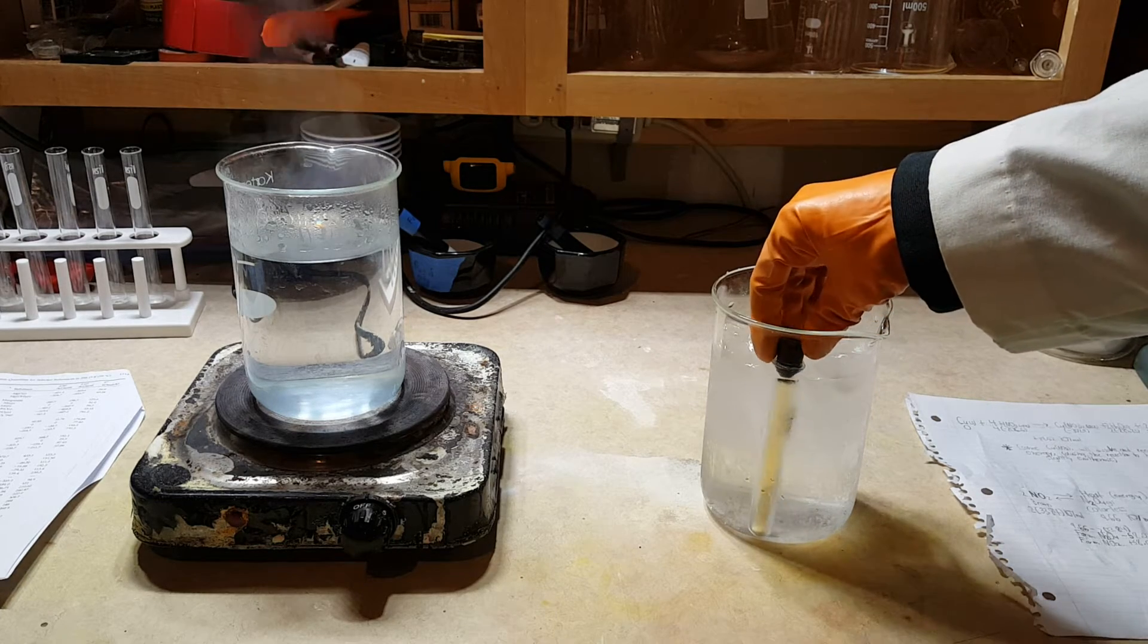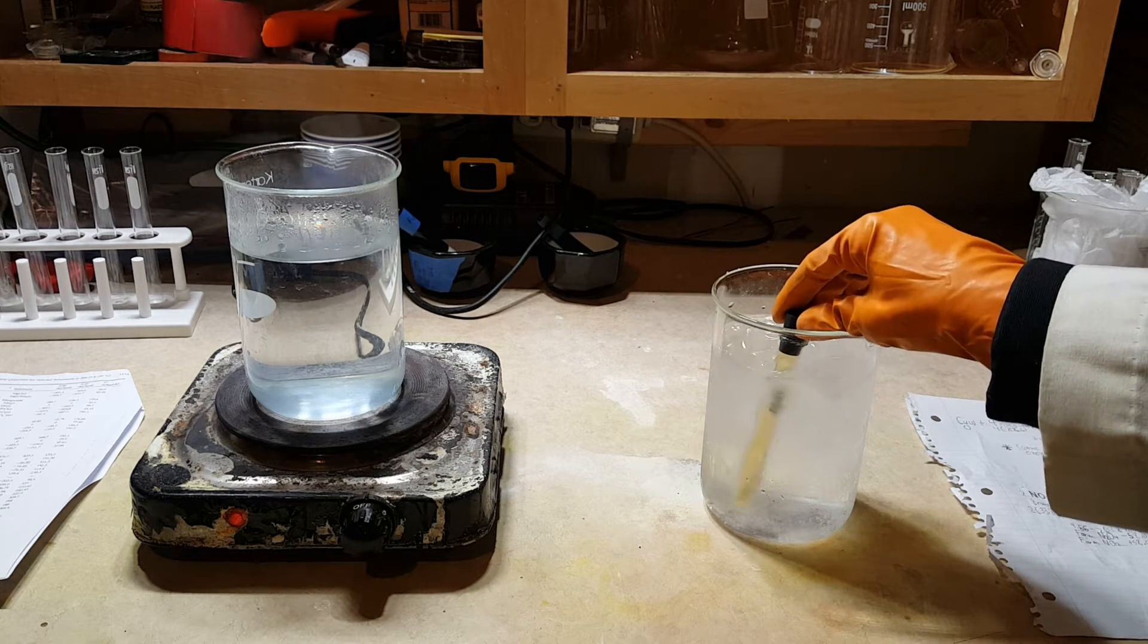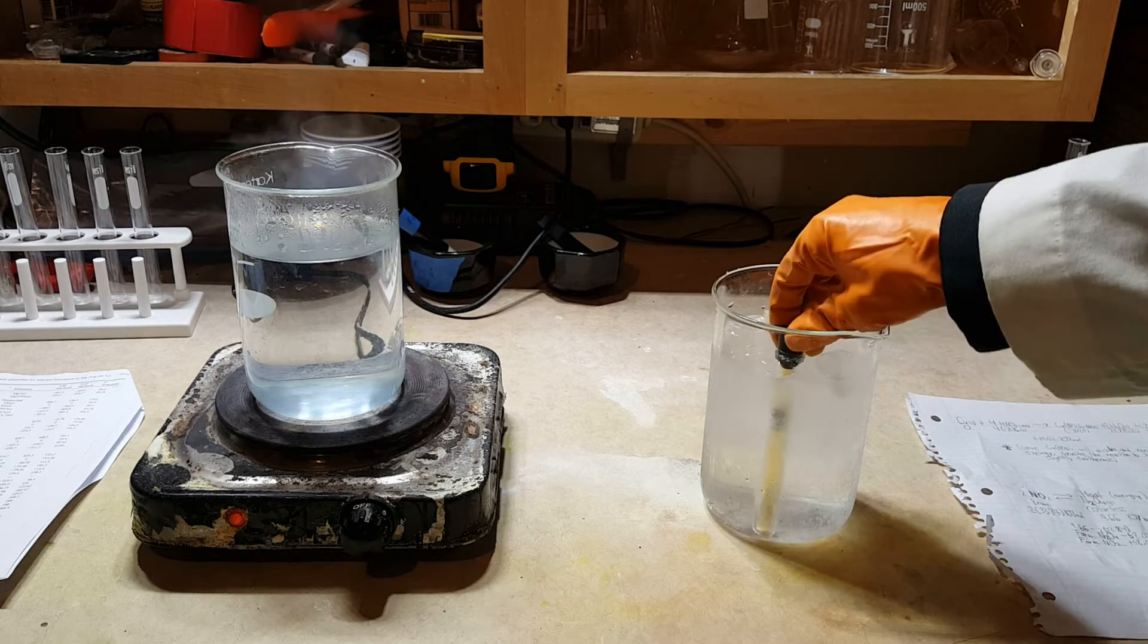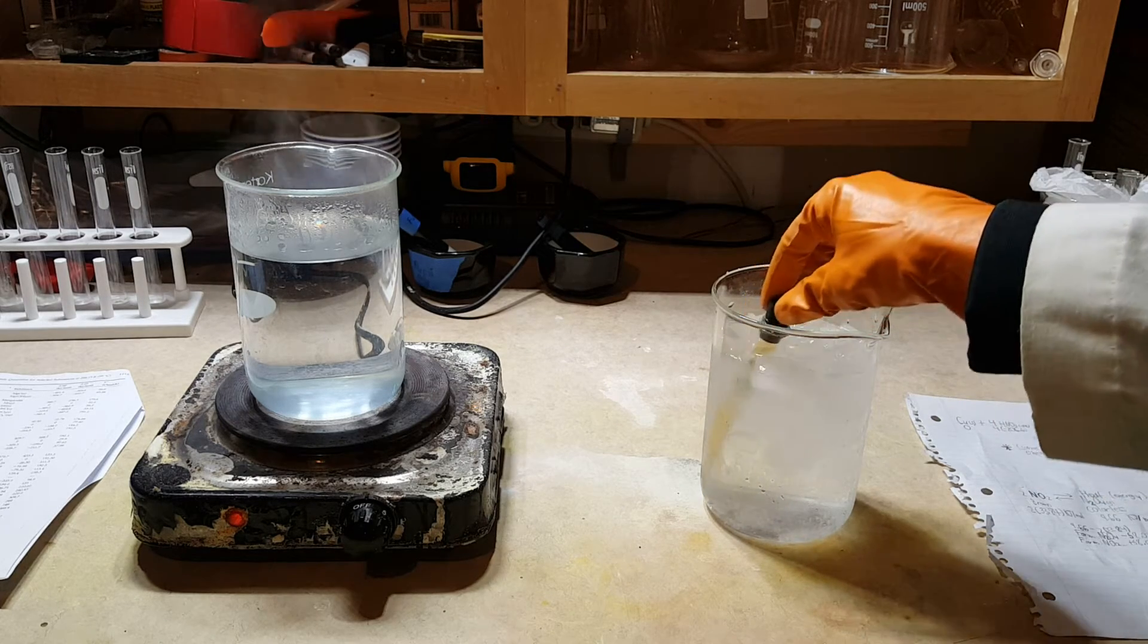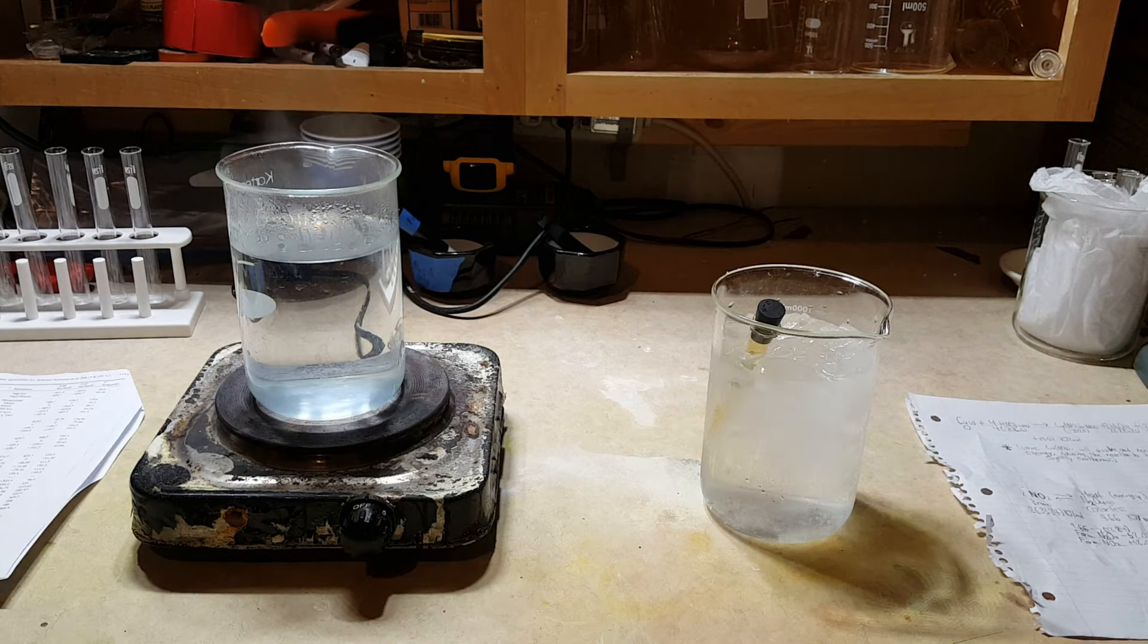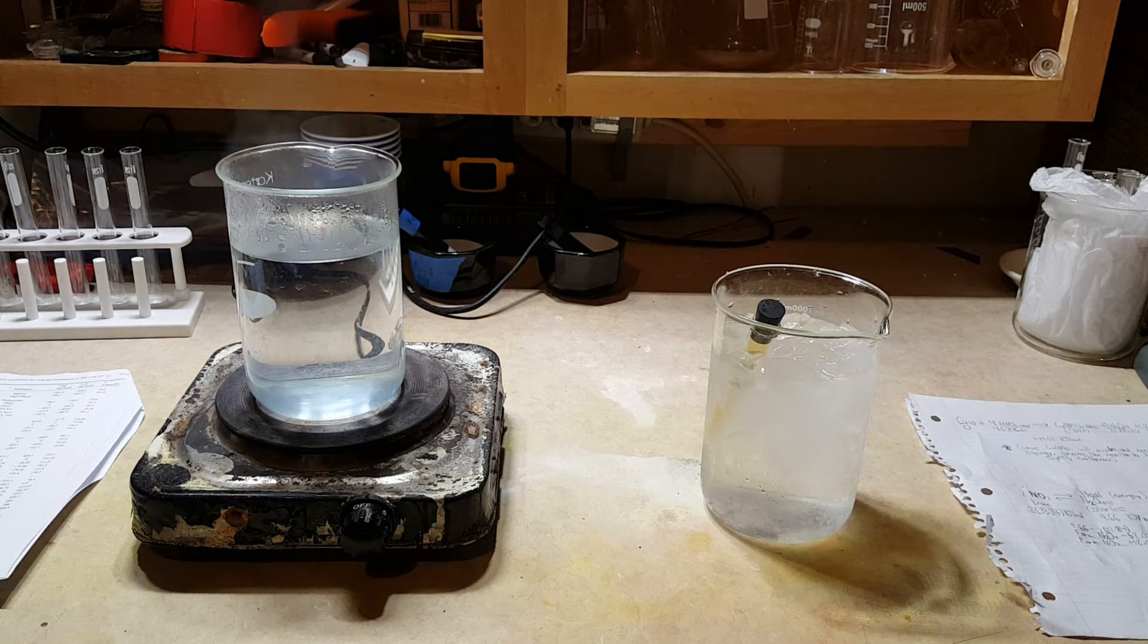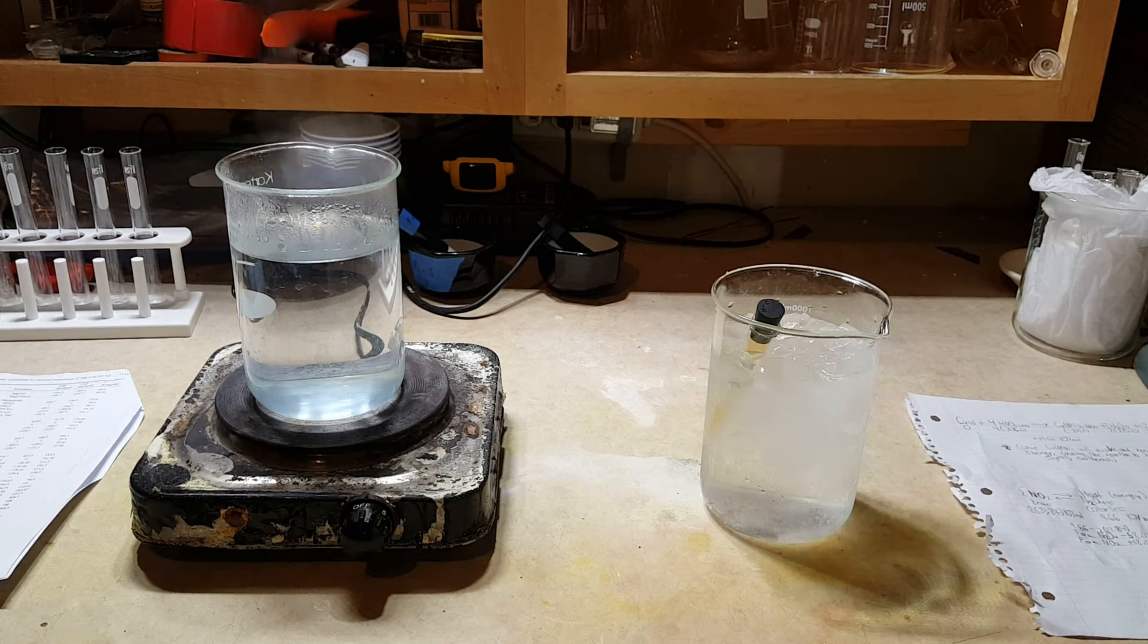Alright, now as we take more and more energy away from this system, more and more dinitrogen tetraoxide, our colorless gas, is going to form. And so as you can see, we have shifted our equilibrium towards the dinitrogen tetraoxide because there's not enough energy there to break it down and form nitrogen dioxide. Let's remove the sample.